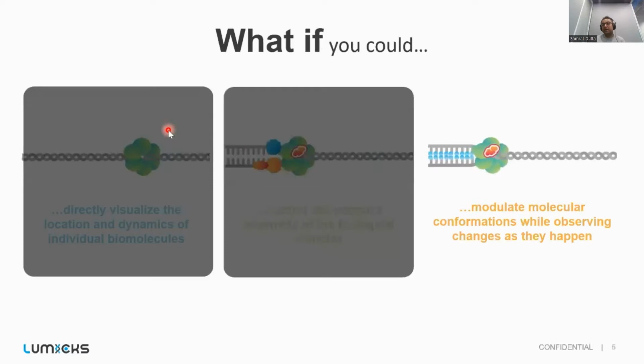And finally, since biological interaction, as I mentioned, undergoes conformational and structure changes, what if we have the facility in the system using which we can manipulate and measure interaction over the biomolecule? As you can see here, this is a fork junction where this complex protein binds very slowly and moves along the DNA. But when the mechanical force is applied on this DNA, this protein molecule starts to move a little bit faster. So in essence, this is the essence of the C-trap technology.